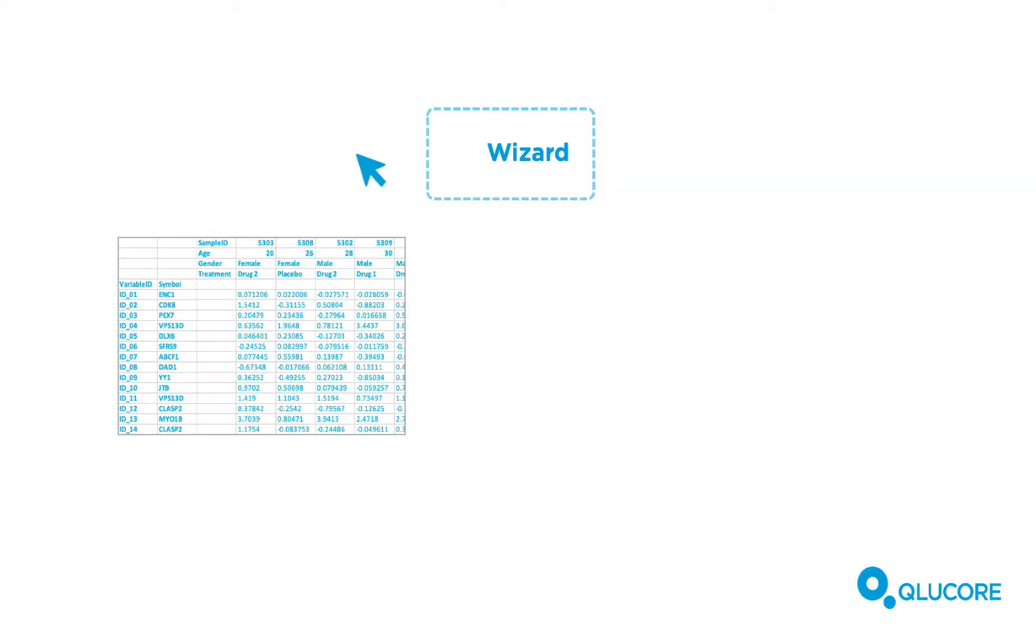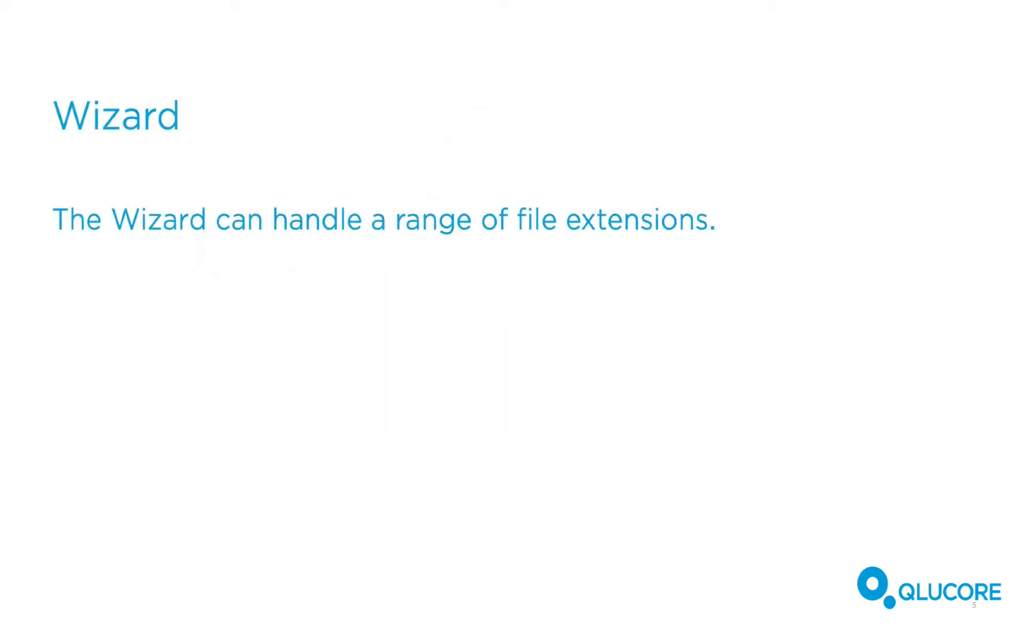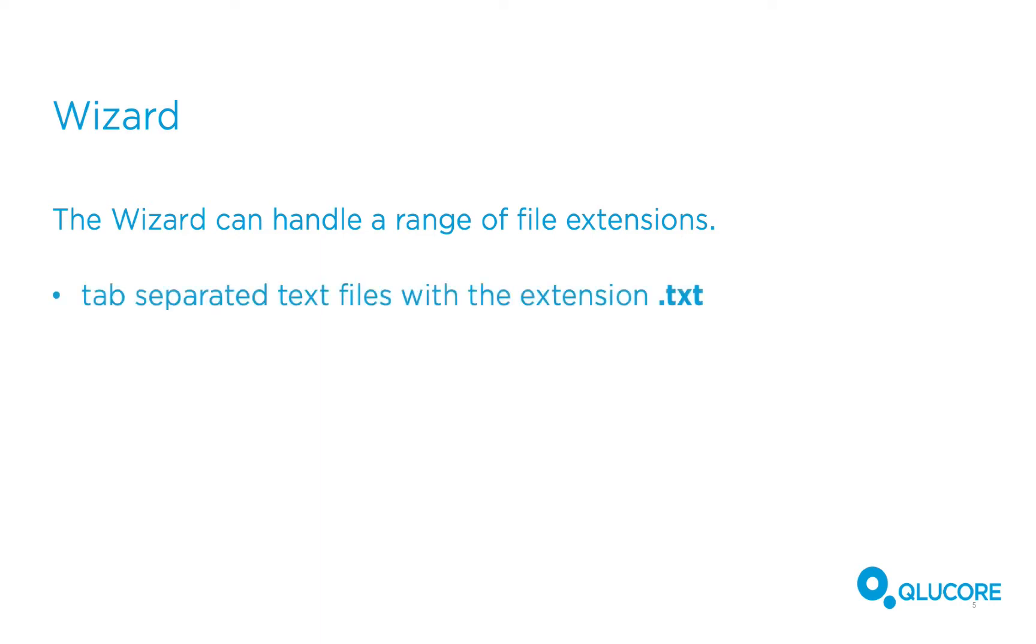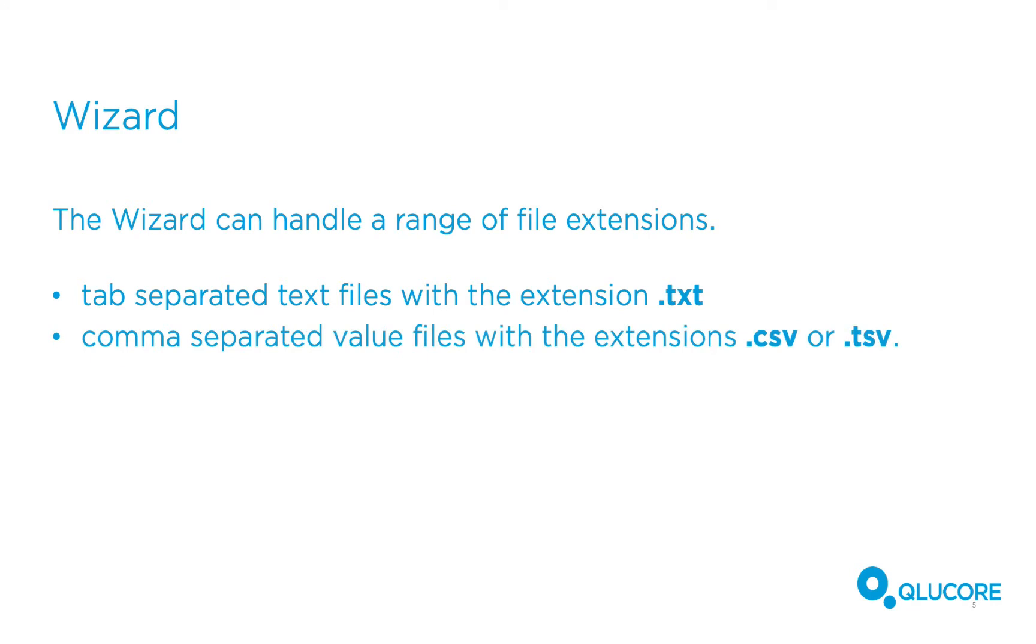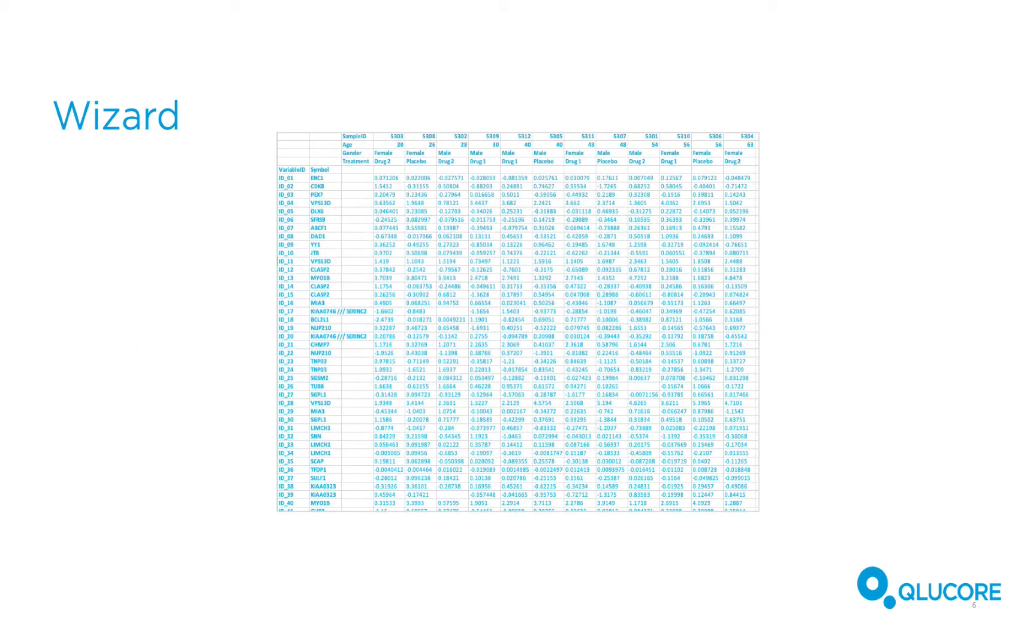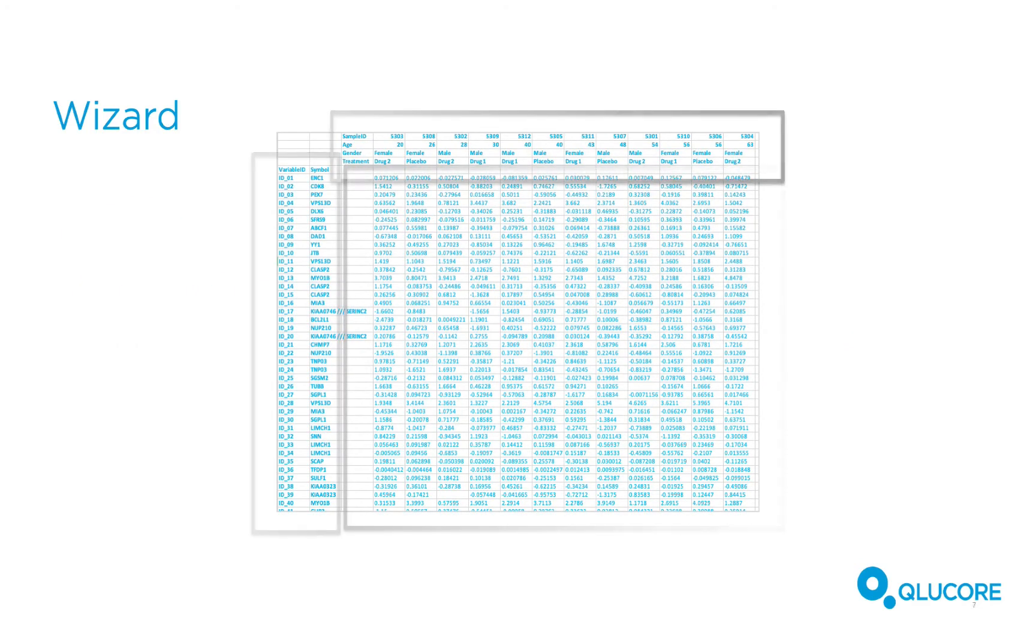Using the wizard, you can import normalized data as well as annotations connected to your data set. The wizard can handle a range of file extensions. Examples are tab-separated text files with the extension txt and comma-separated value files with the extension csv or tsv. The wizard will guide you and help to define which blocks of a file are data and which are annotations.